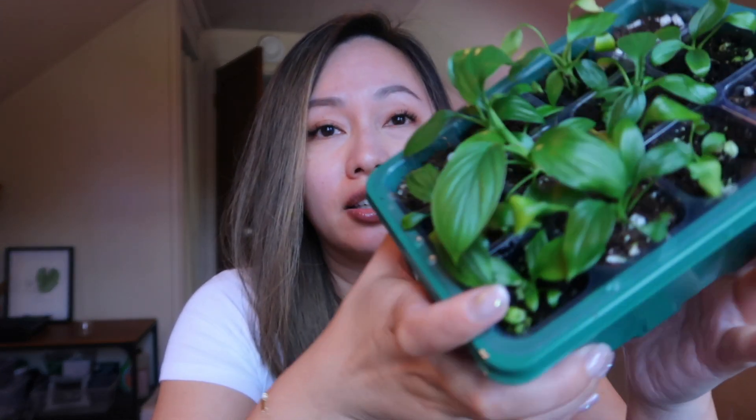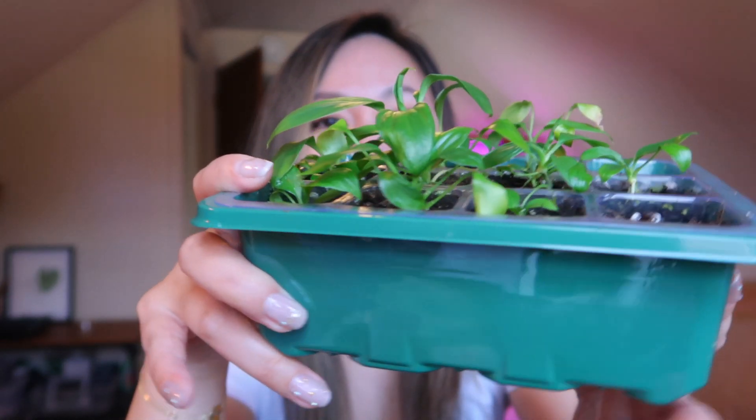I honestly haven't done anything special other than move the plants from one location to another, because I wanted the plantlets to have a different set of lights. Previously they had white lights, and I felt like it wasn't doing enough because it was growing at a fast rate but not fast enough for me. I found that any of my plants under the grow lights over there stimulated more growth — I had better roots and the foliage was a lot bigger. And it worked. I'm happy with my change.